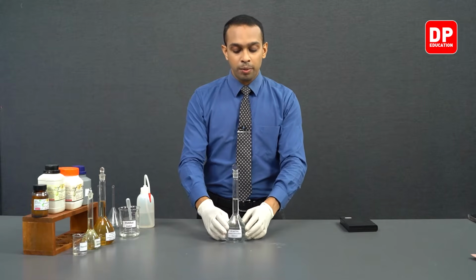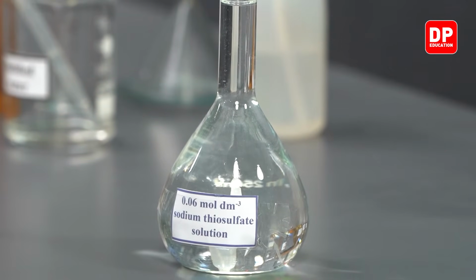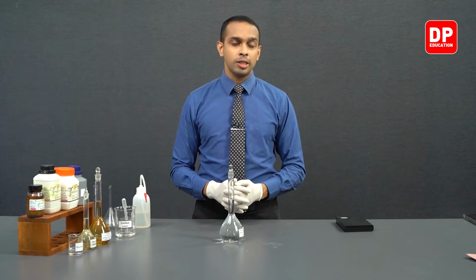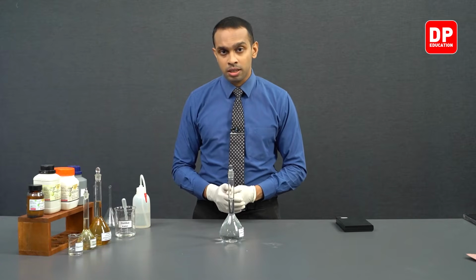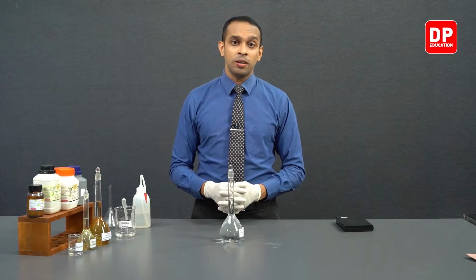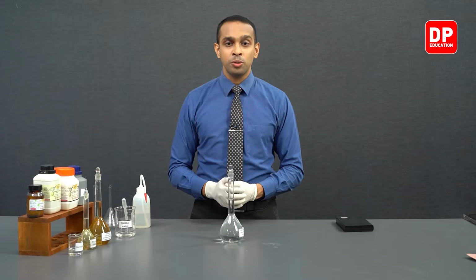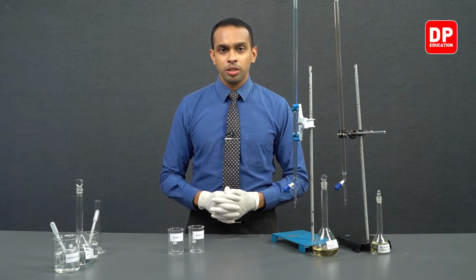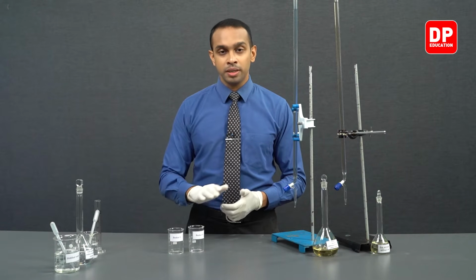So now students, we have prepared the 3 different solutions we'll be needing for this experiment. Now students, it is time for us to move on to the next part of the experiment where we will be actually conducting this experiment and observing the time taken for each reaction to take place. So let's move on to the next part of this experiment. Now students, we are going to be measuring different solutions into these 2 beakers.